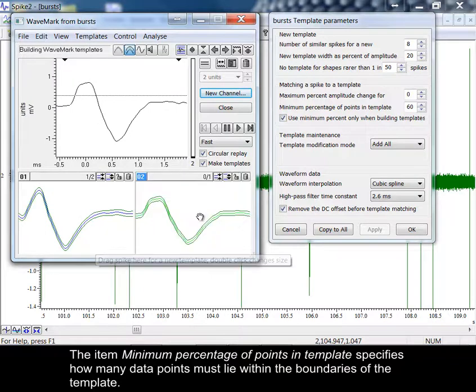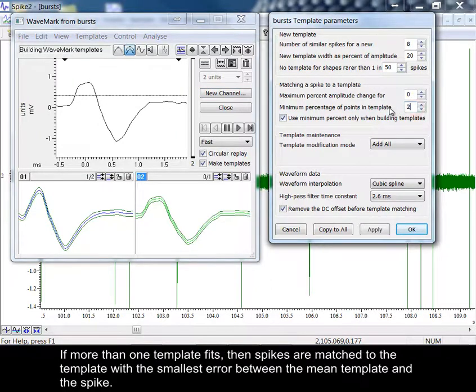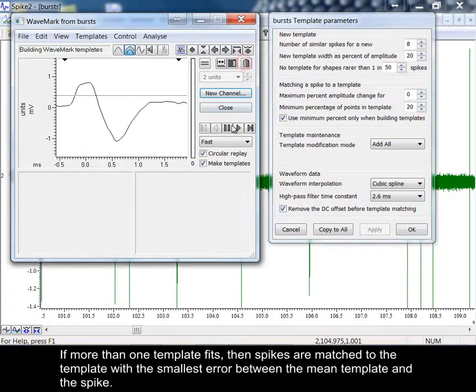The item minimum percentage of points in template specifies how many data points must lie within the boundaries of the template. If more than one template fits, then spikes are matched to the template with the smallest error between the mean template and the spike.